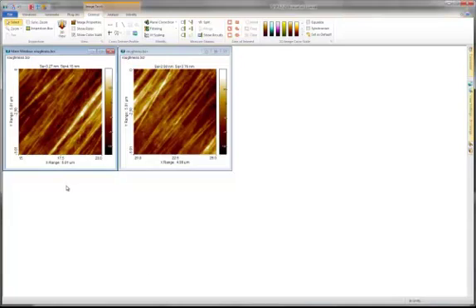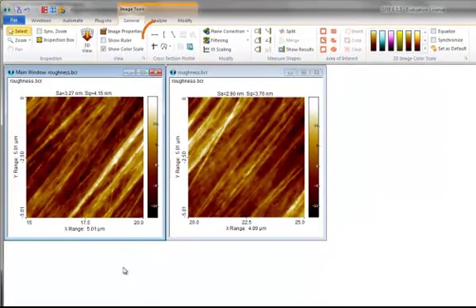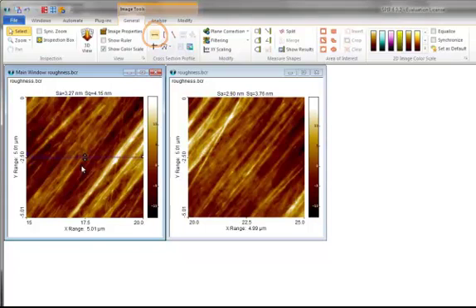This tutorial will show you how to stitch cross sections manually in SPIP. Start by opening your images and draw a cross section in each image.